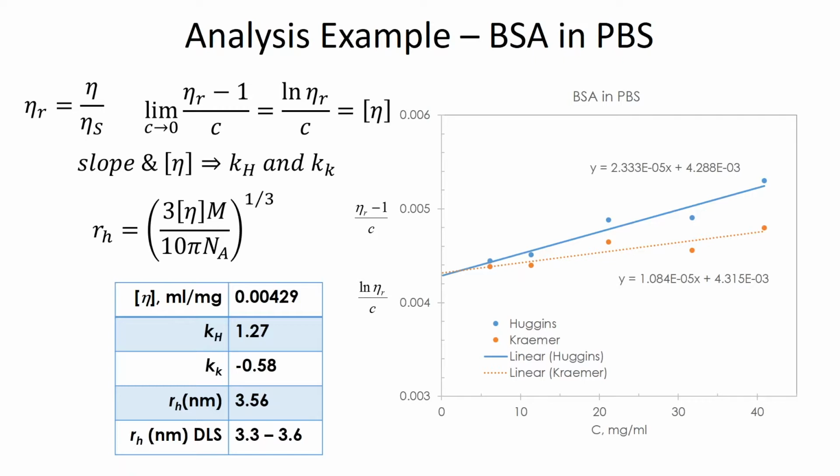And as we mentioned before, pH and ionic strength are very important to the nature of the molecule in your solvent and are going to shift things a bit. So to make an exact comparison, you'd have to have a sample that is very clearly equivalent. So this is just an example of one particular material and one particular solution.